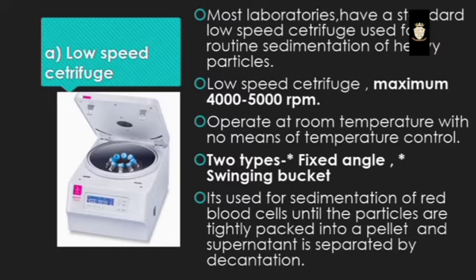Two types: fixed angle and swinging bucket. It is used for the sedimentation of red blood cells until the particles are tightly packed into a pellet and the supernatant is separated by decantation.